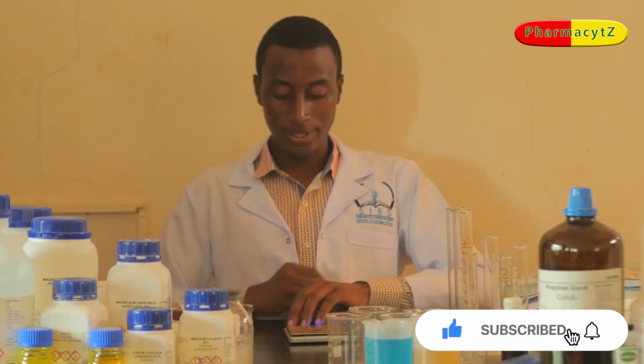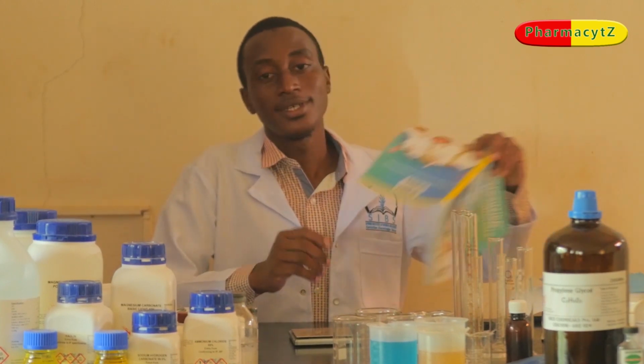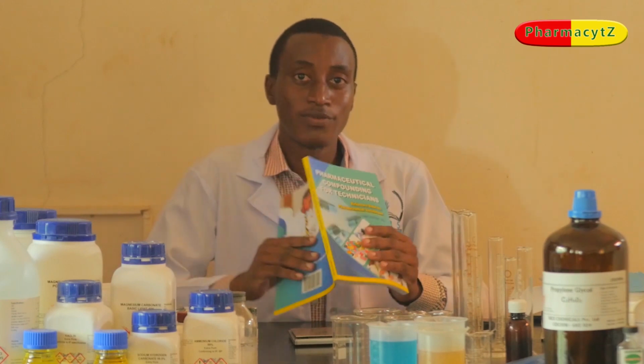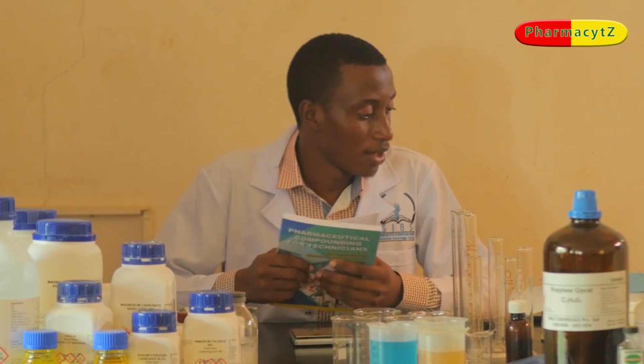In order to do that, you need to have the official formula. The official formula can be obtained from different reference materials, especially the Tanzania Pharmaceutical Handbook, Pharmaceutical Codex, and many others. Here with me I have the PCT, Pharmaceutical Compounding for Technicians, the Tanzania Pharmaceutical Handbook, and the Pharmaceutical Codex. So how do you obtain the official formula from these books?